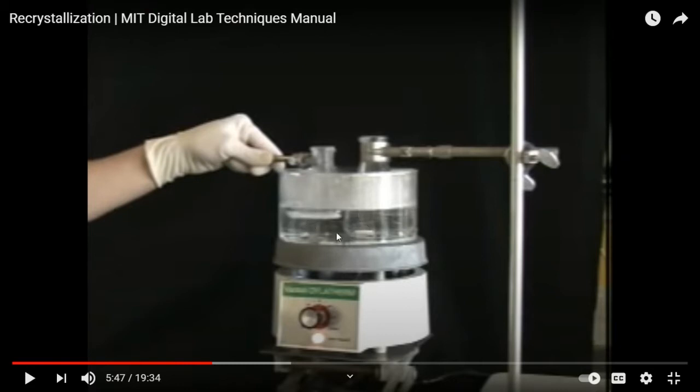Anyway, so you are adding new hot solvent into this to dissolve it, as we talked about. But we have to use a minimum amount of solvent. It's not going to be 10 milliliters all the time. It depends. So how do you know? As soon as you dissolve everything here, that's when you stop adding. And that can be 10 milliliters. Sometimes it can be 1 milliliter, honestly speaking. So no one knows. The only known thing is what the textbook says to add. Doesn't mean you always add that amount.